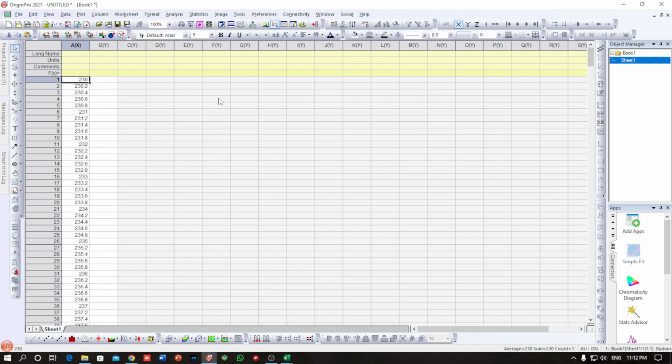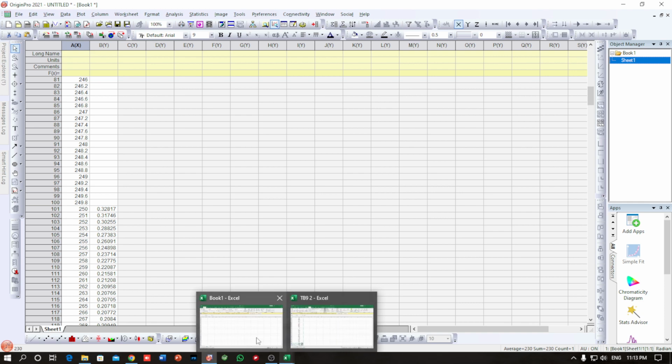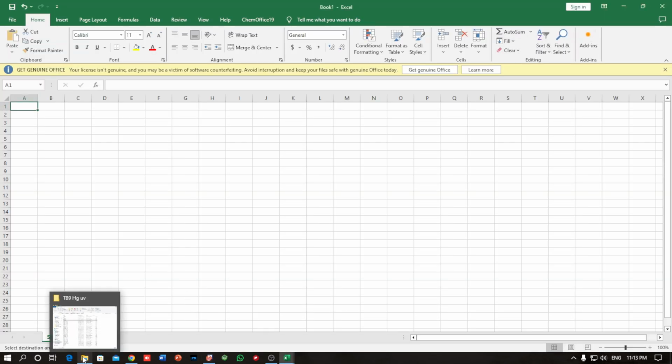At the moment, at first, you might think that the y value is omitted, but actually this is not. If we scroll down to the lower portion, you can find that the y value started from 250 wavelength. Before this, the wavelengths are not available here. So what we have to do is delete this value later. But before that, I am showing you another data conversion.